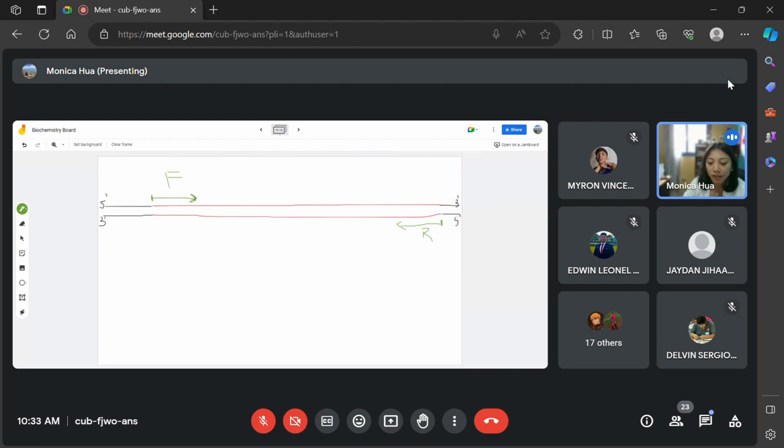We're a bit behind on the topic, so the theory might be a bit rough, but when we go through PCR next week, it makes more sense, because it's too long to talk about in this lab session. But you will need to create a forward primer and a reverse primer in order to fully copy that specific template.